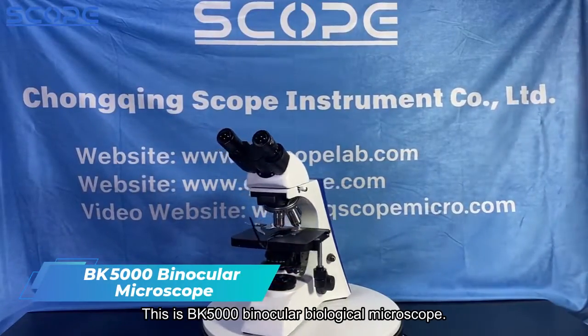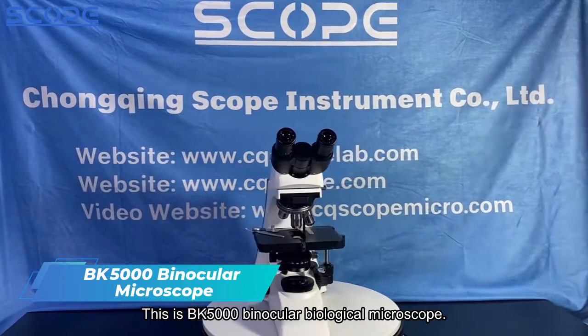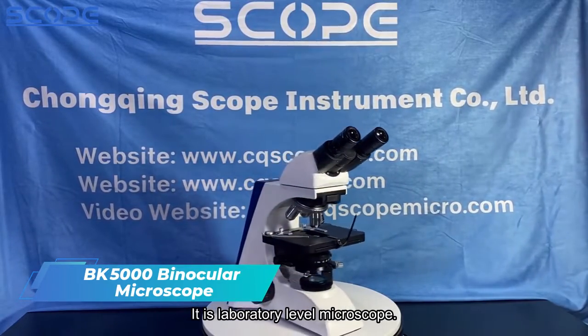This is the BK5000 Binocular Biological Microscope. It is a laboratory level microscope.